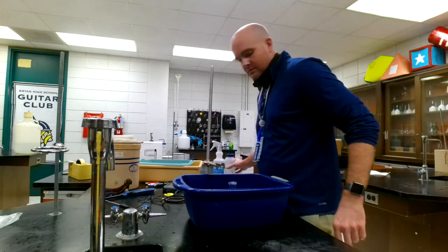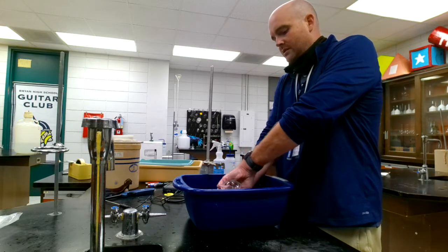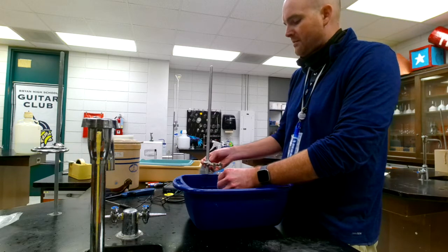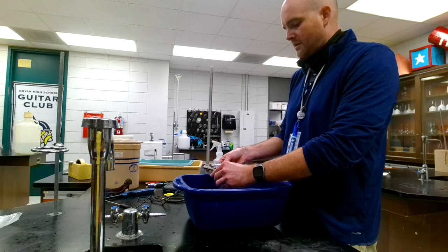Then I'm going to place my hand on top of it, seal it, and invert it so that there are no holes. It's holding just like a column of water, basically. As long as I keep it underneath the water level, it will be fine.